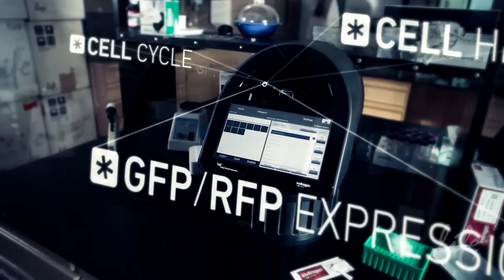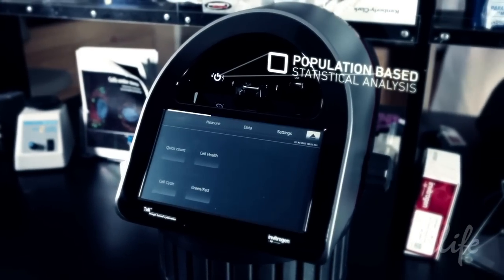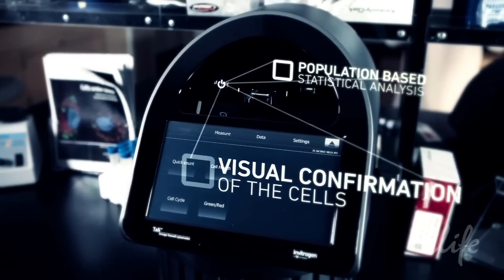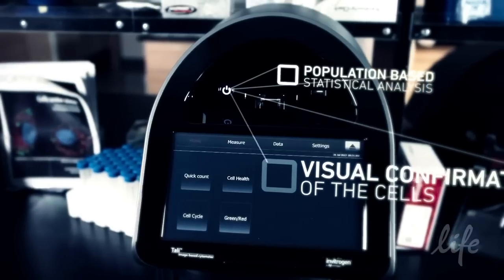By providing population-based statistical analysis along with visual confirmation of the cells, TALI offers you added confidence in your results.